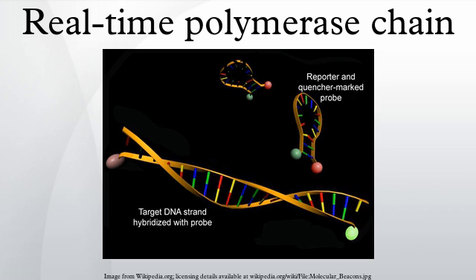As the process of creating a transgenic plant normally leads to the insertion of more than one copy of the transgene, its quantity is also commonly assessed. This is often carried out by relative quantification using a control gene from the treated species that is only present as a single copy.